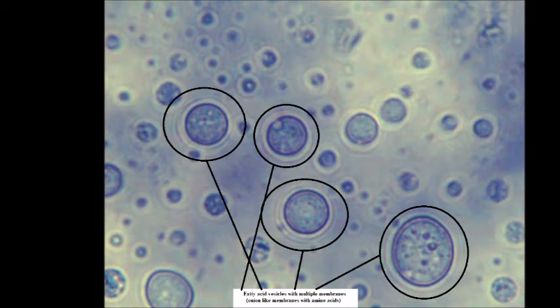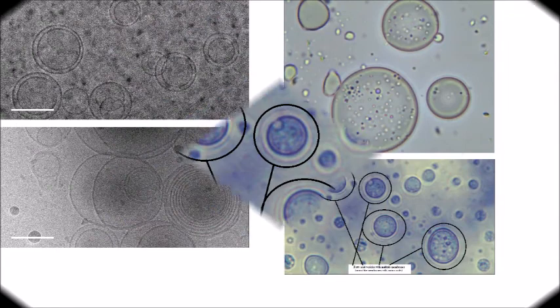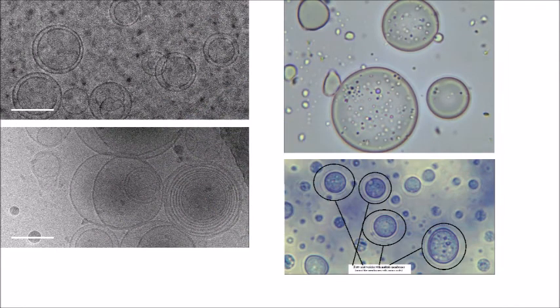And I will show the original experiment which was done, which is the black and white image, as well as my experiment, which confirms the same results. So again, here is the black and white image on the left with the control on top and the experimental solution on the bottom. And again, my replication of this experiment with the control solution on top and the experimental solution showing the multiple membranes on the bottom image. That would be on the right.